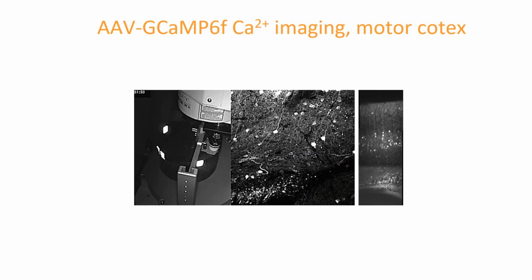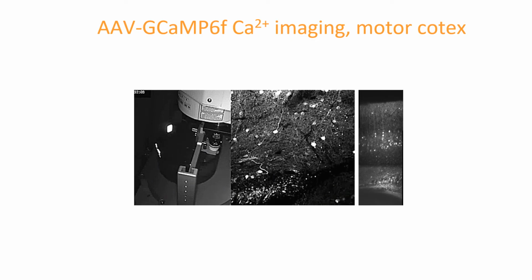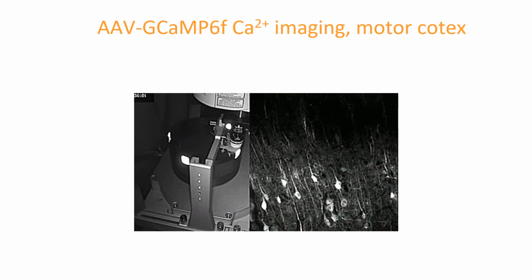Here are some more examples of neurons firing in the mouse brain while the mouse is moving. And on the right hand side you can also see the reconstruction, the projection of the whole cortical columns of neurons imaged from the side, all the way from corpus callosum through layer 6 to layer 1. And here is another beautiful example. They're quite mesmerizing to just watch.